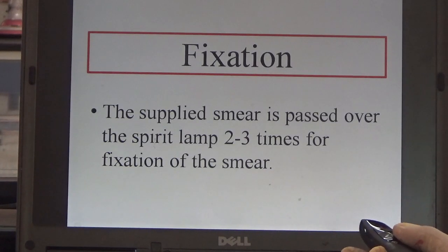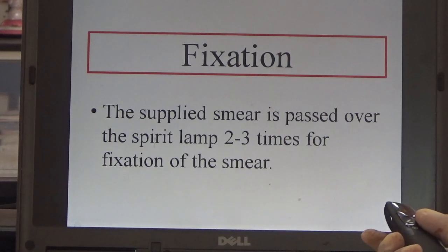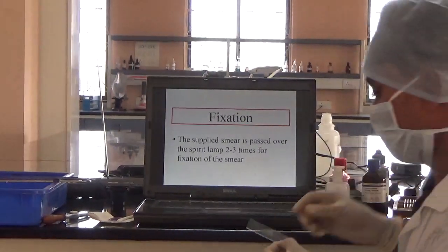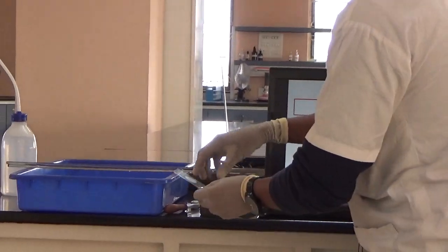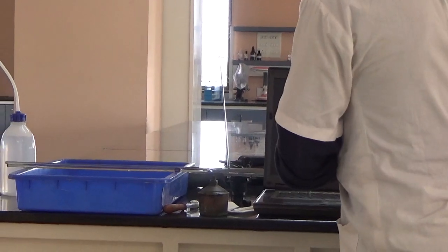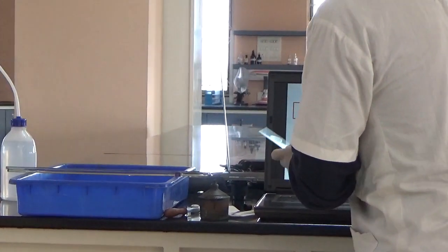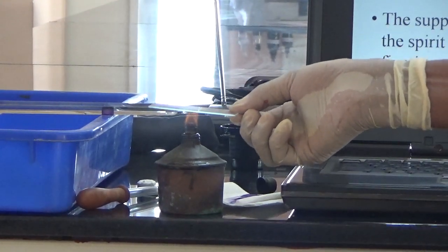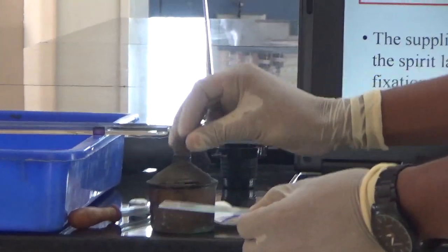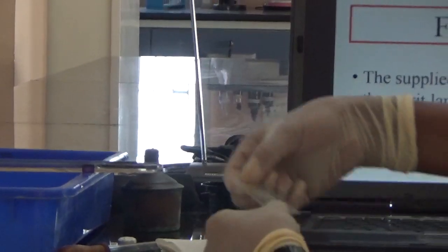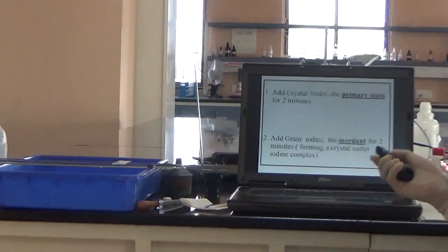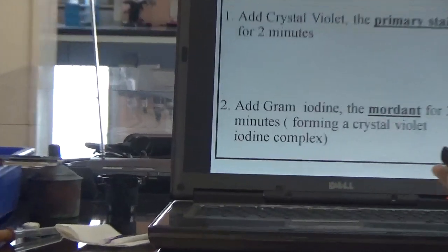At first, fixation: the prepared smear is passed over the spirit lamp 2 to 3 times to fix the smear. Then add crystal violet, which acts as the primary stain, and wait for 2 minutes.